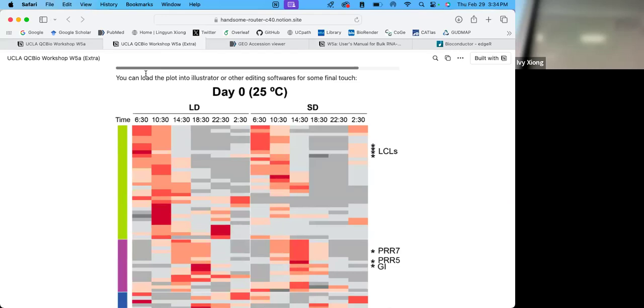You don't need that arrow. Once you run the R script, you can change the gene name inside. When you want to run different genes, you just have to change the name in the command line. Yeah, and then it gives you different data, different output for that particular gene. We'll double check that everything I want runs. Let me try different ones, because we only tried that one, right?